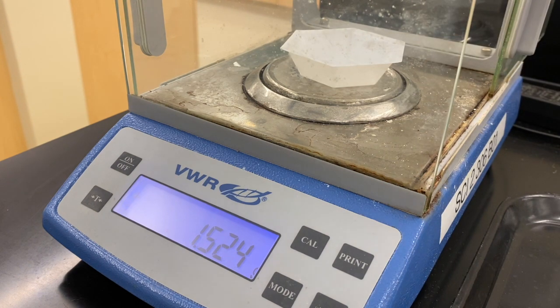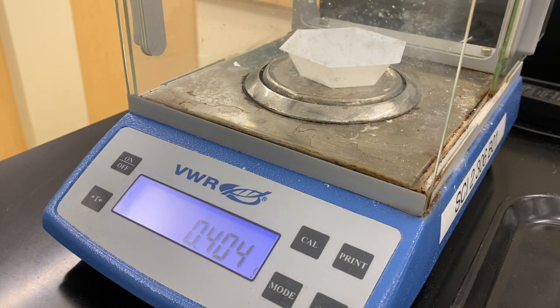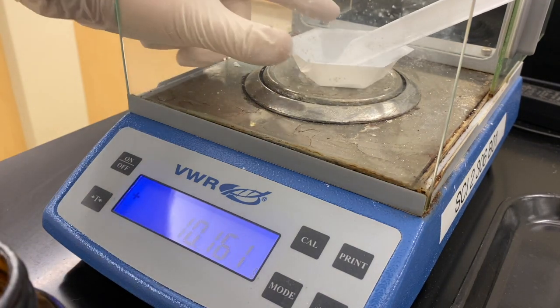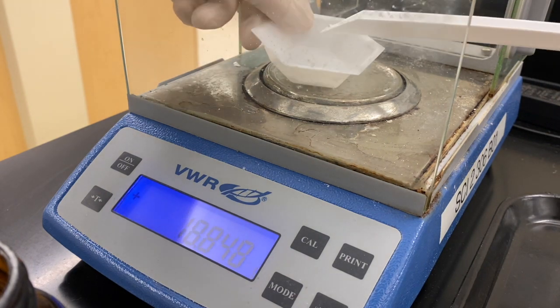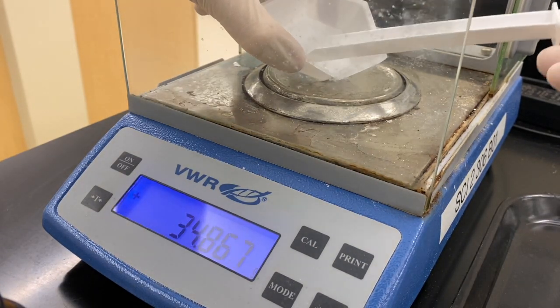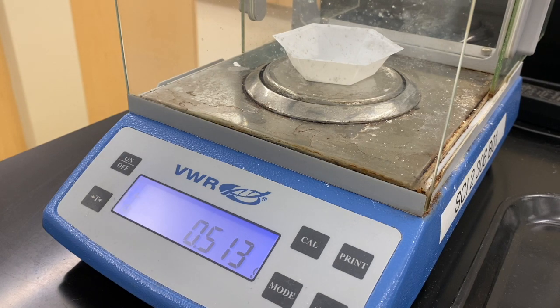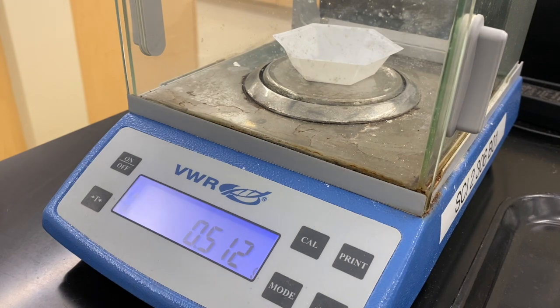We're going to start off the lab by weighing out 500 milligrams of trans-stilbene. We're going to tare the container and add our trans-stilbene. A little bit more — almost there. Too far, so let's go back a little bit and fix this. All right, that should be close enough. That's how much we're going to be using for the lab this week.